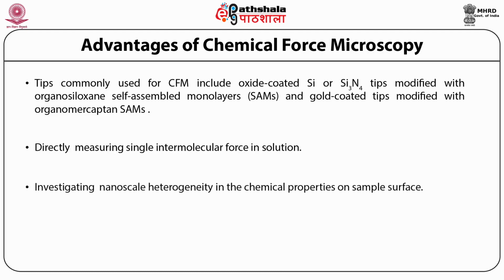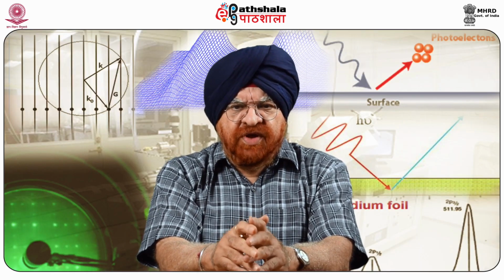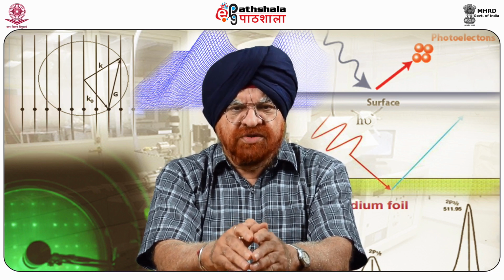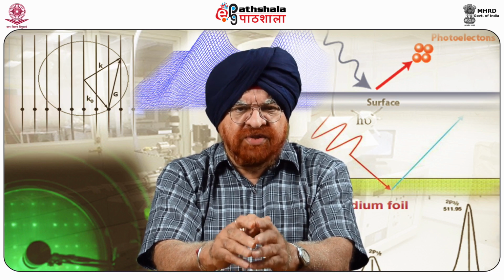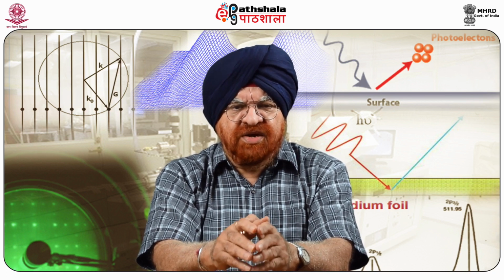Second, investigating nanoscale heterogeneity in the chemical properties on the sample surface. A biological application of CFM at the nanoscale level is the unfolding of proteins with a functionalized tip and surface. Due to the increased contact area, the tip and the surface act as anchors, holding protein bundles while they separate.